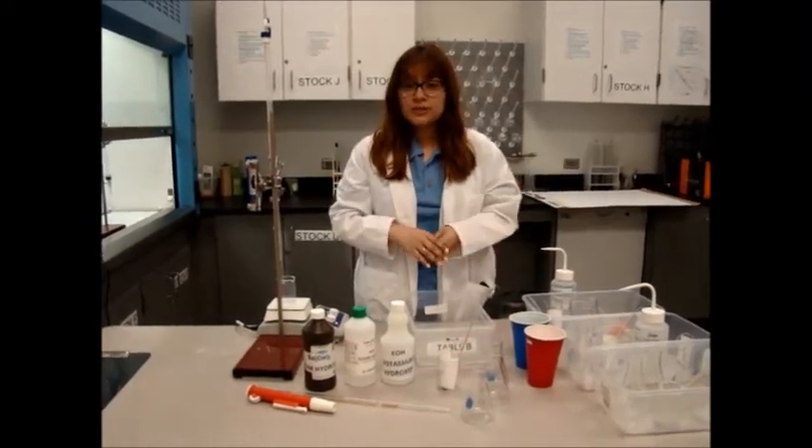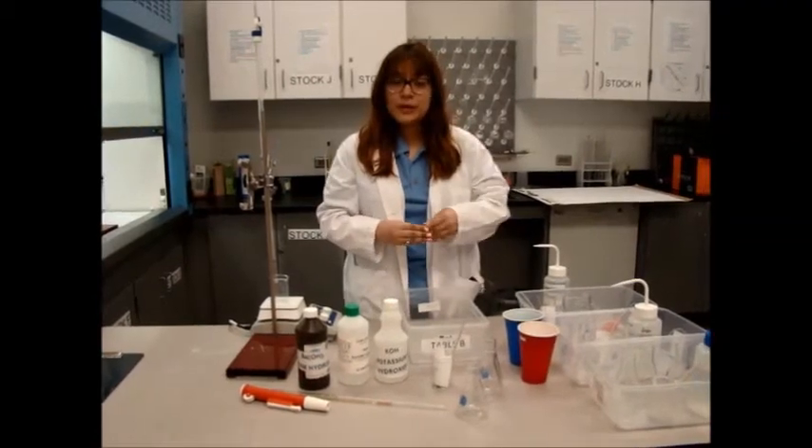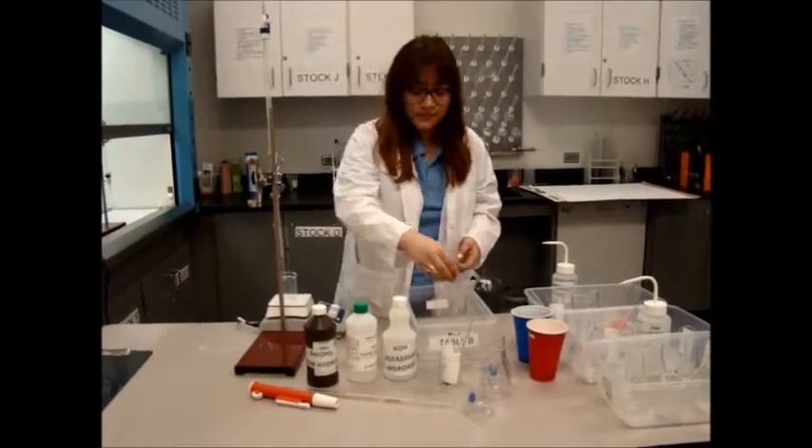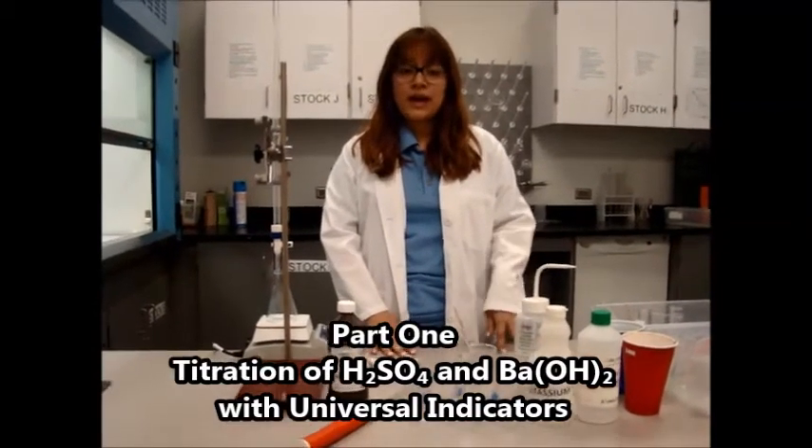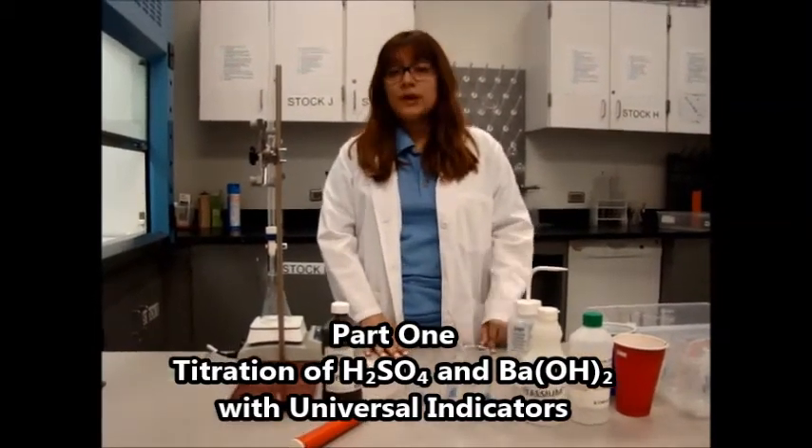That pretty much concludes the materials video for your 2017 spring practical exam. This is part one of the practical exam, which is going to be the titration of sulfuric acid and barium hydroxide.